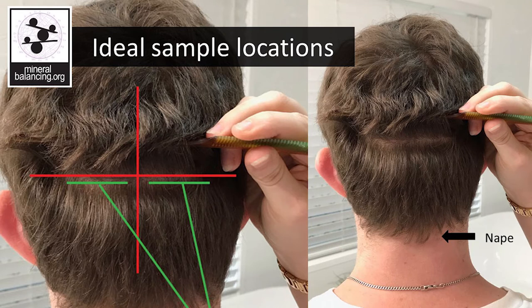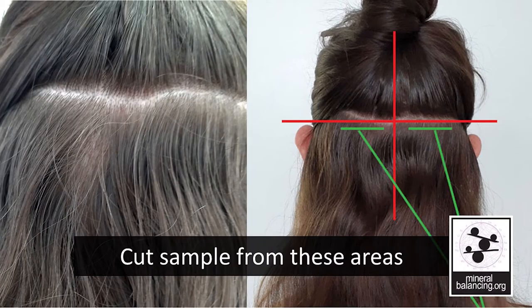The green section is where we prefer to cut the samples from. When a sample is taken from this location, it is not noticeable with most hairstyles, even short hair. The same rule applies for long hair. Here's the client one day after taking the hair sample — the spot is nearly invisible. Many of our clients are worried that taking a sample will ruin their hairstyles, but if you follow these guidelines, you won't even notice it's missing.